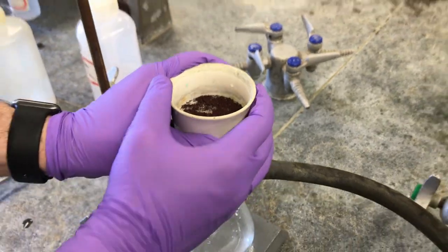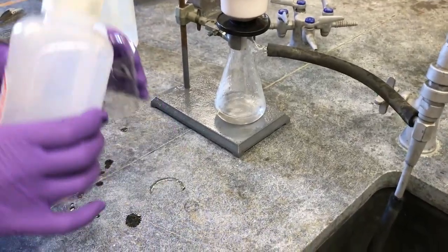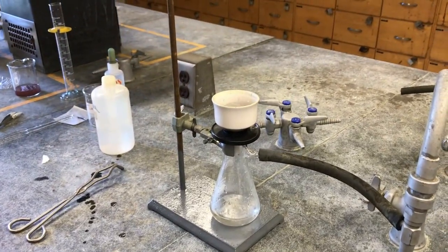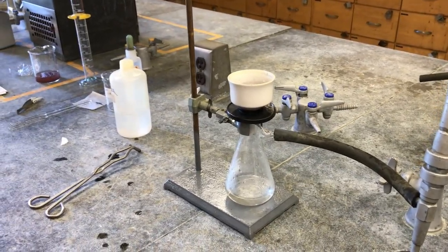You see it's getting dry. So just a little bit more acetone, even though sometimes it squirts out of the bottle.